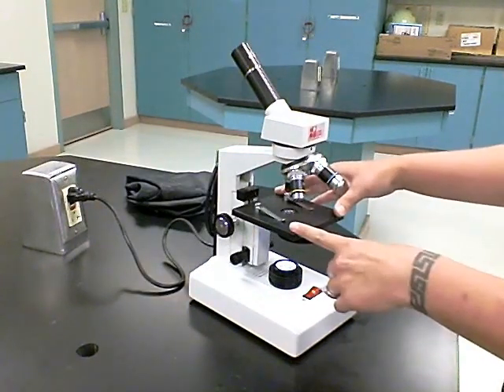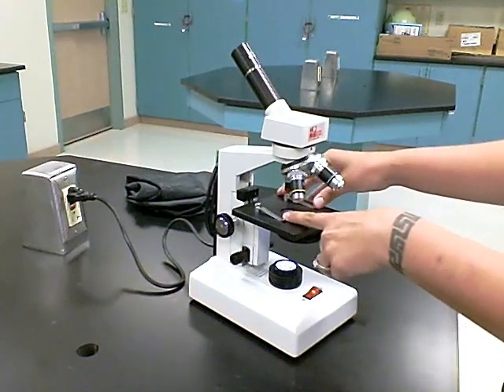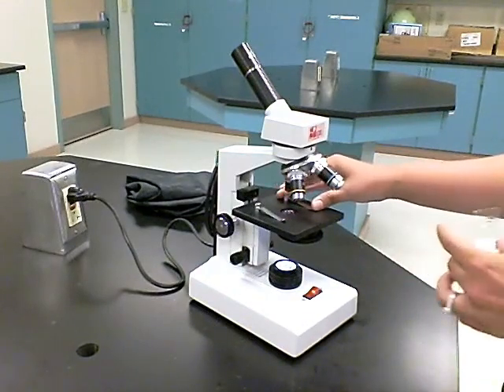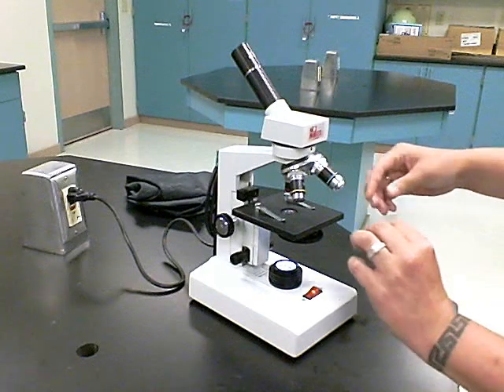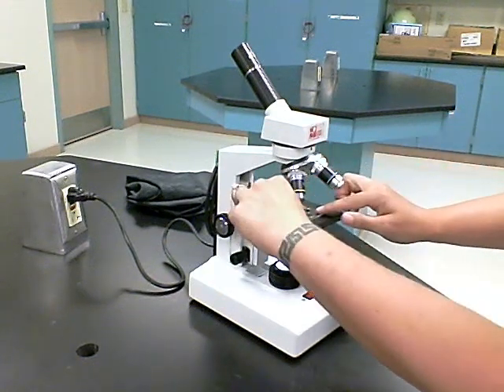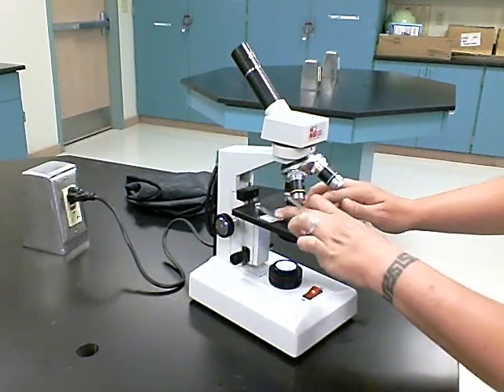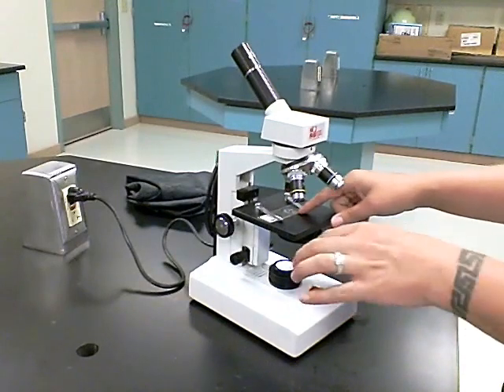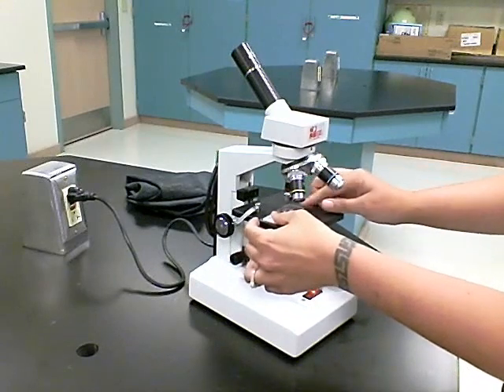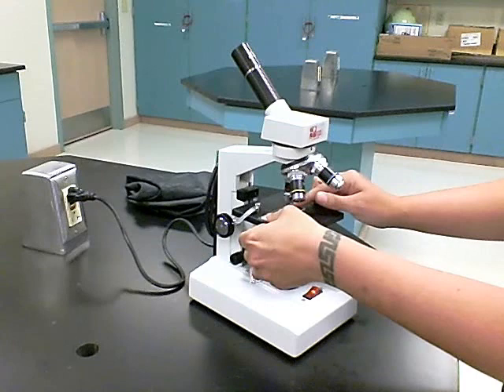Okay, this microscope in particular does not have a mechanical stage. This is the stage here. You'll see that there are two stage clips. And some choose to use these clips, some choose to not use them. If you do plan on using your stage clips, they will hold your slide in place. You need to place your slide underneath the stage clips and move it so that the specimen is directly in the light. Now, if you choose to not use these stage clips, you just simply push them to the side, and again, you place your slide on the stage where you can see your specimen is directly in the center of the light.